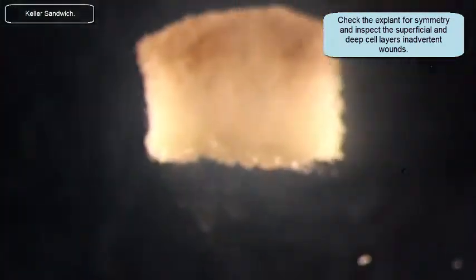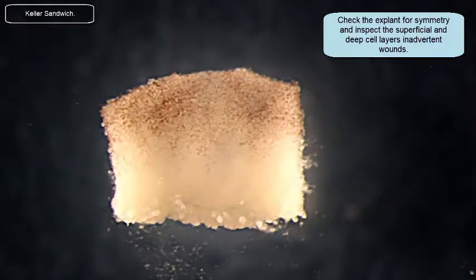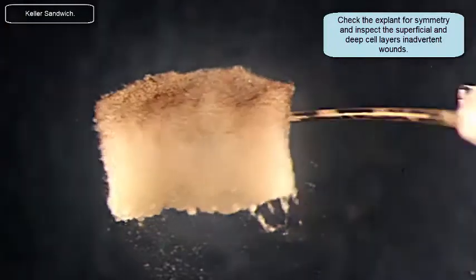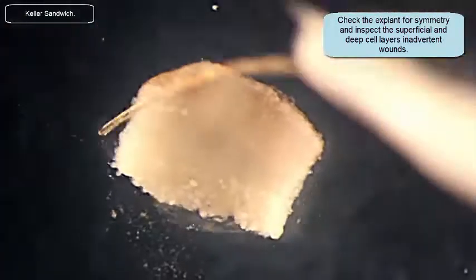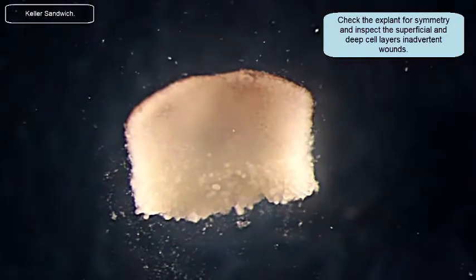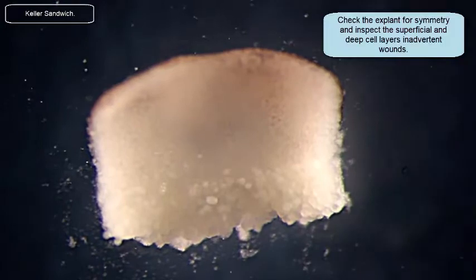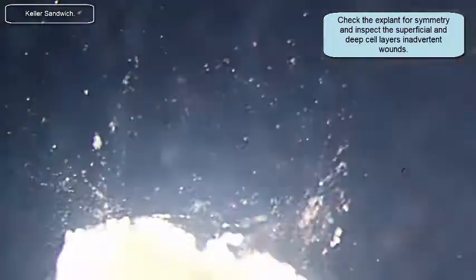I'm just cleaning it up, and now I'm going to inspect it to make sure there are no big cuts or wounds that would preclude me from using it in a sandwich. That one looks good. I'll look at the inside — it also looks good. Note the big vegetal cells on the vegetal side and the tiny cells on the animal side. It's very smooth at that point.